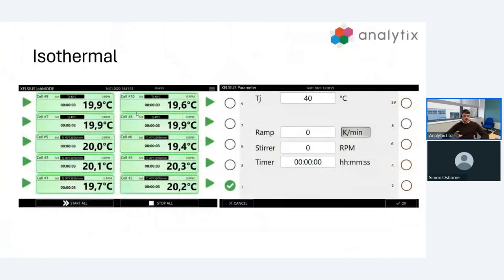We have two principal modes of operation with Excelsis: isothermal methods and ramp cycles. First I'm going to cover isothermal methods. On the left you can see our starting screen for Excelsis. You can see all 10 cells and the temperature at which they're currently at. This gives us mass control of all cells.